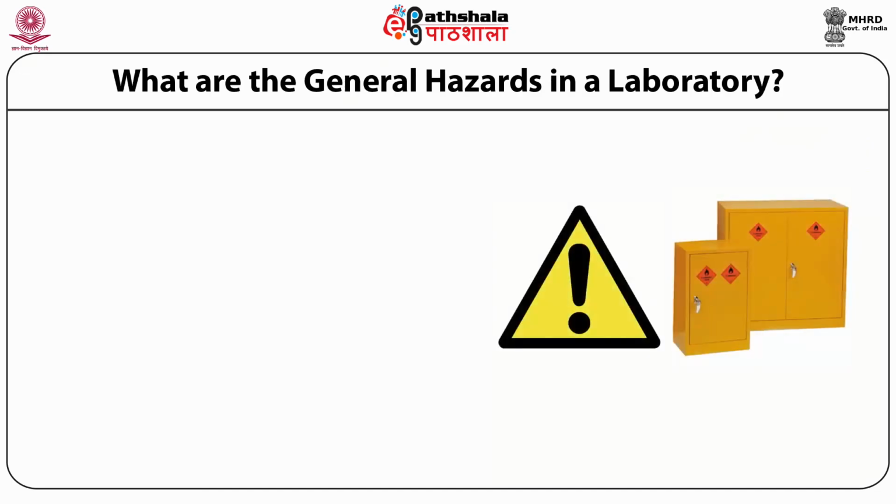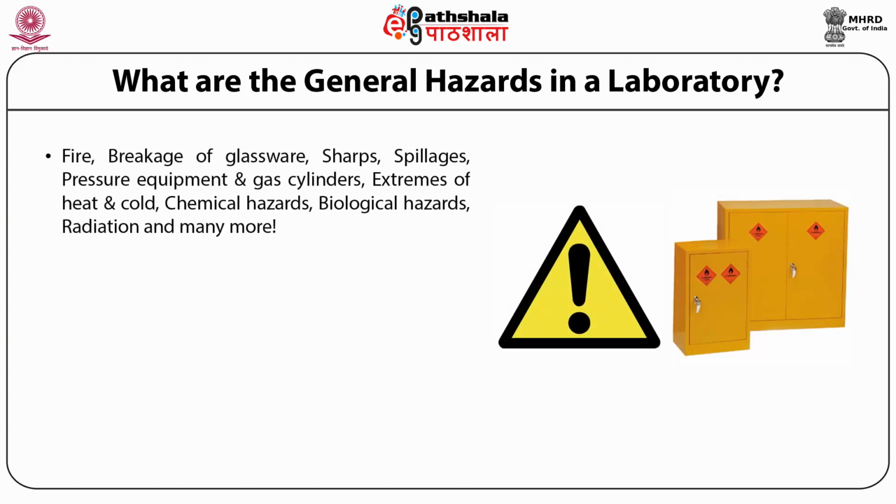So what are the general hazards in the laboratory? The general hazards are fire, breakage of glassware, sharps, spillages, pressure equipment and gas cylinders, extremes of heat and cold, chemical hazards, biological hazards and radiation, and there are many other hazards. The first hazard is fire.